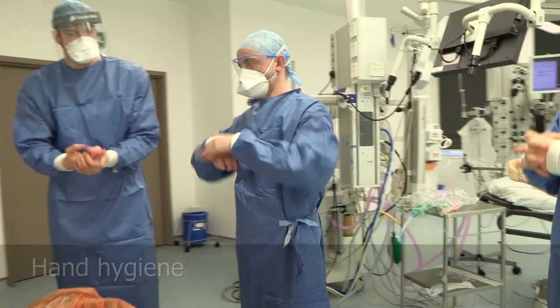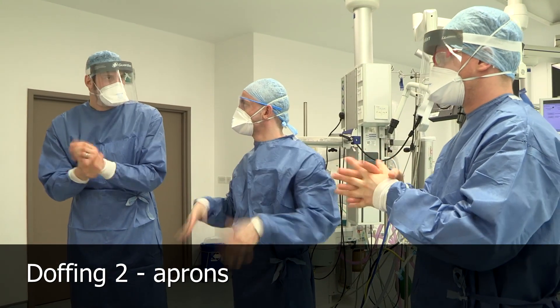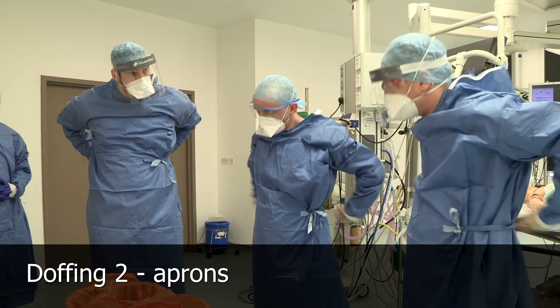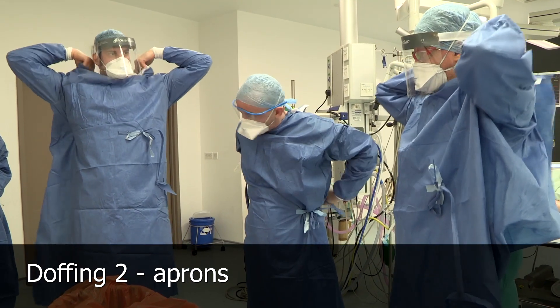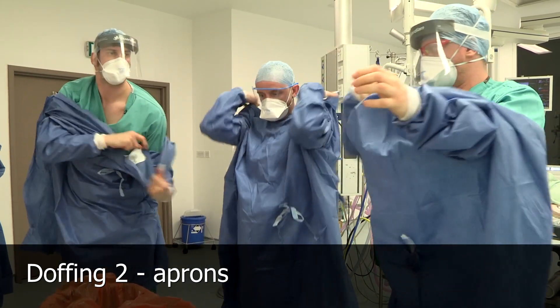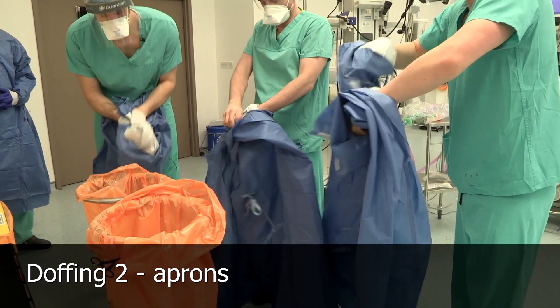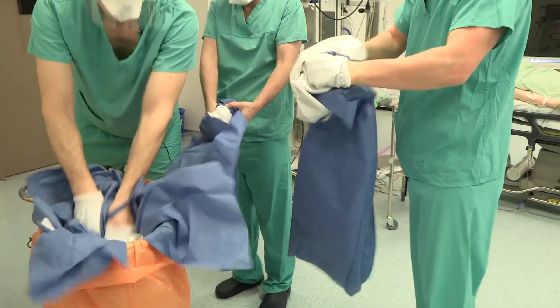Now we're going to try and doff our aprons without touching the front of them, which is tricky, but we'll do the best that we can. Hands behind necks and pull the first attachment, then hands behind back and pull the second attachment. Then reach behind from the inside — you're not touching the outside — and start to roll from the inside, roll into a ball and straight into the bin.